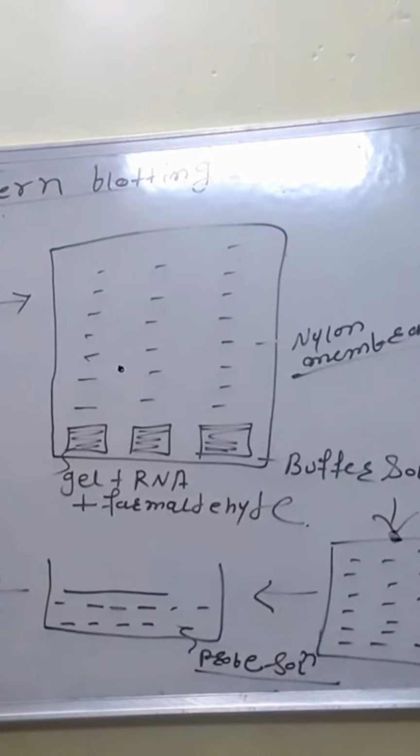That is a very beneficial technique to easily separate RNA molecules. If we want to separate RNA molecules from any cell or any other solutions, DNA synthesized by them, and want to know their sequences and complementary sequences in any case, we always apply northern blotting techniques. It is very beneficial and very useful for quick separation of these molecules on the basis of molecular size.